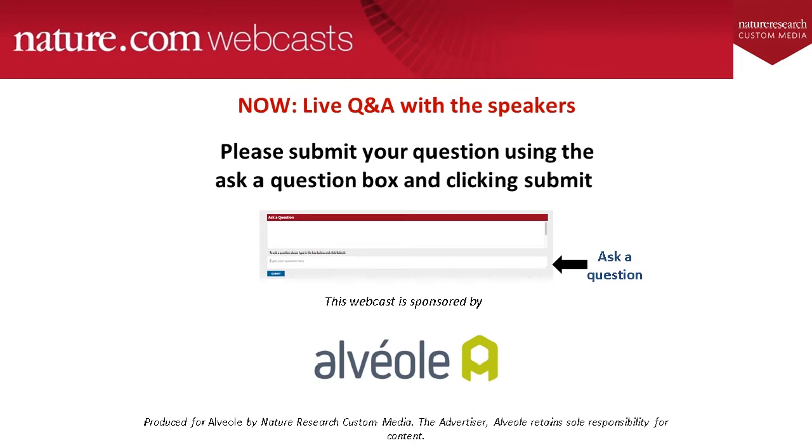Yeah, this is a really good question. It's going to depend heavily on the cell type. So, of course, different cells behave differently. For example, when I was working with fibroblasts, you can get the cells to fully spread in about 2.5 hours. Whereas when we were working with MDCK cells, you're actually going to want to leave them overnight to get them to spread across these micropatterns.